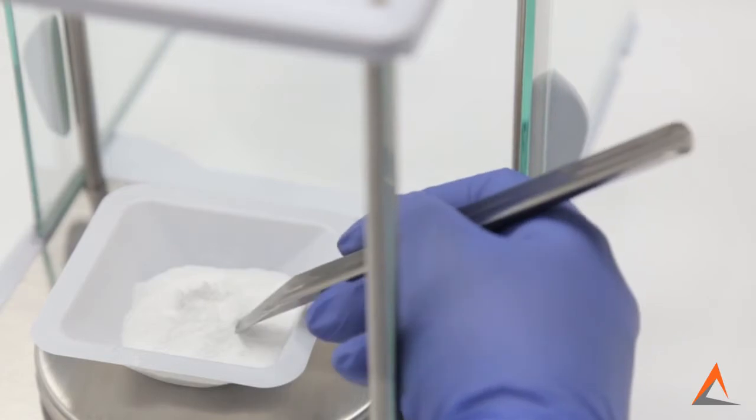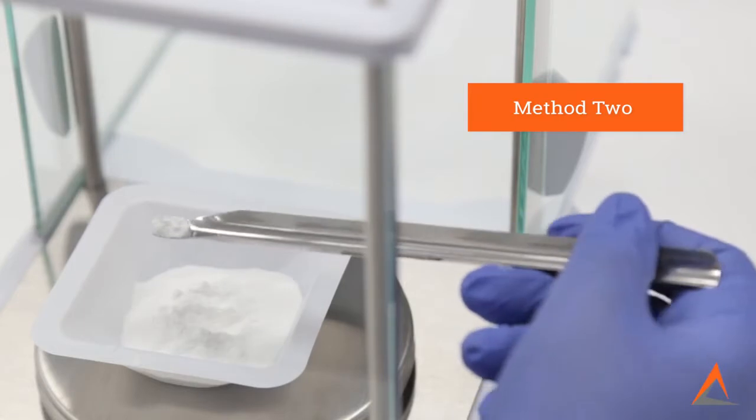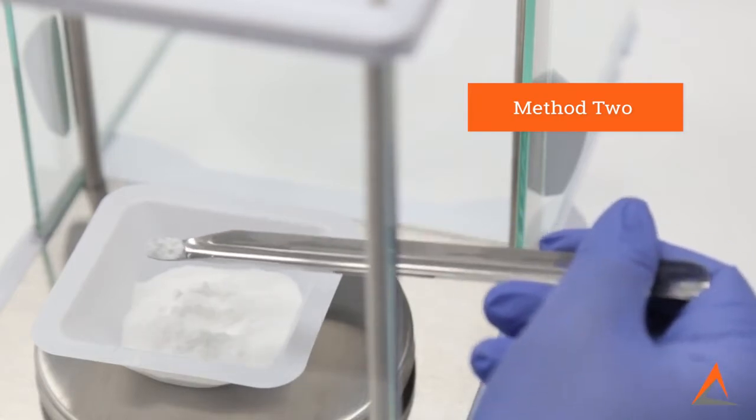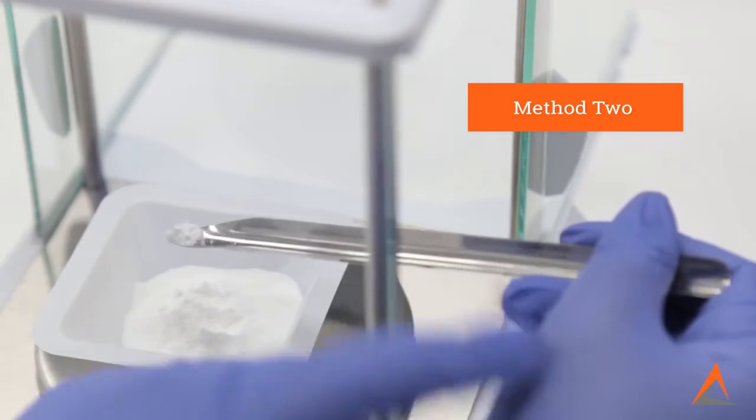Lastly, if you feel more comfortable holding the spatula at the far end, you can use your second hand to lightly tap the hand holding the spatula. Once again, this allows for more controlled movement so that you can slowly add powder into your weigh boat.